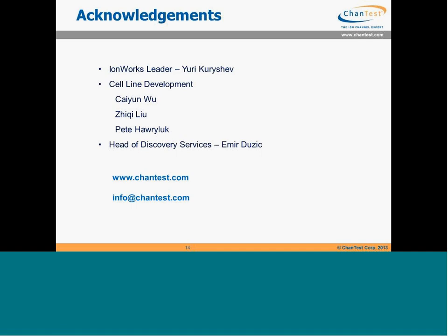Yes. A lot of companies run assays using barium as a charge carrier in CAV channels. And we've tried that in both Quattro and Barracuda with the hope that it would reduce the amount of rundown. But in our hands, it really didn't help to reduce rundown, which is always a problem in these types of assays. Parenthetically, Barracuda seems to be less susceptible to the rundown error, because with 384 wells and continuous clamping, you can finish your experiments more quickly, and that avoids some of the loss of signal due to long-term recordings that can produce rundown.